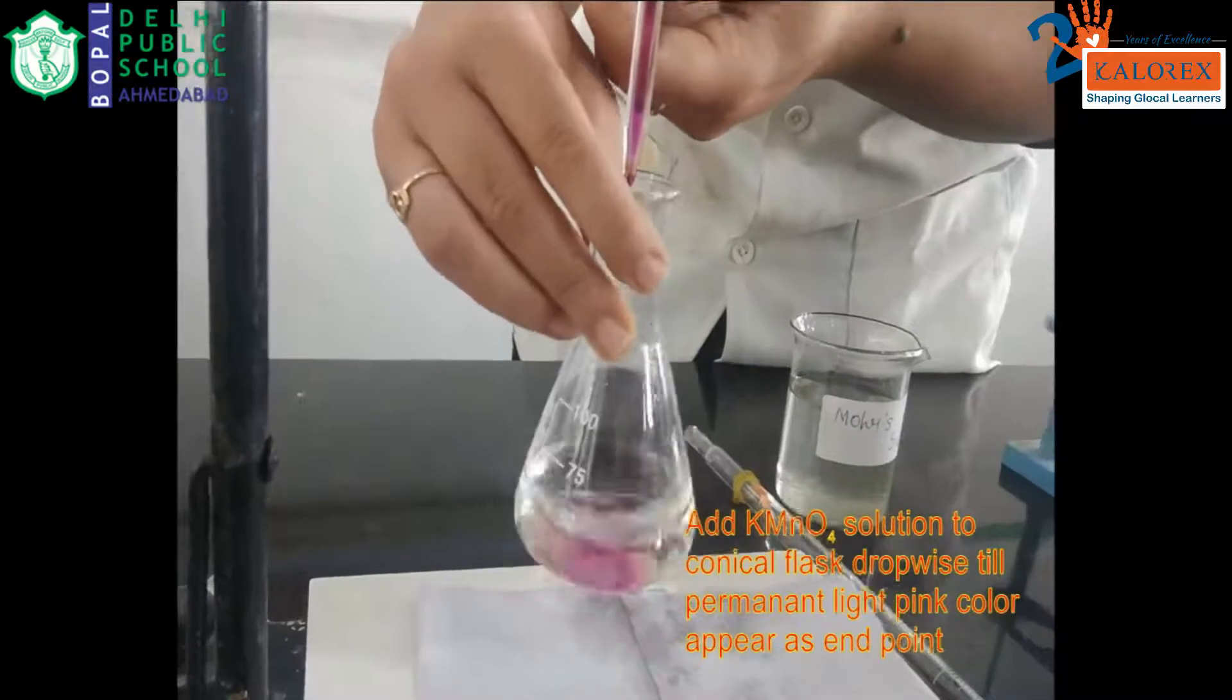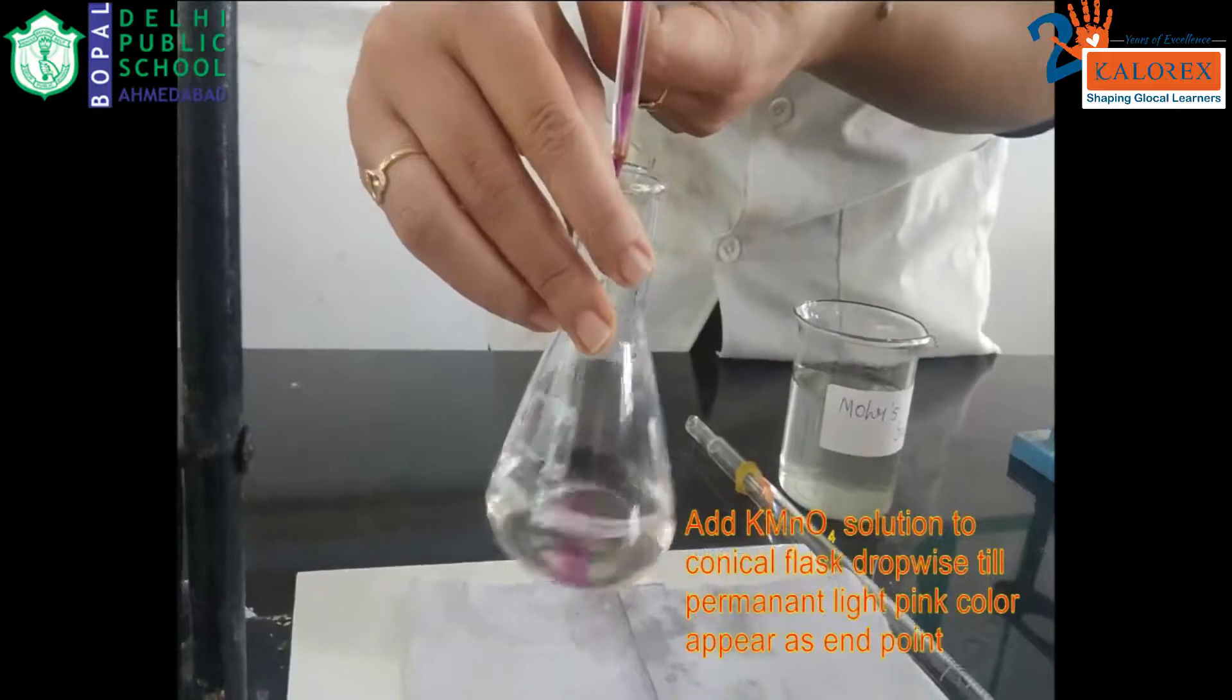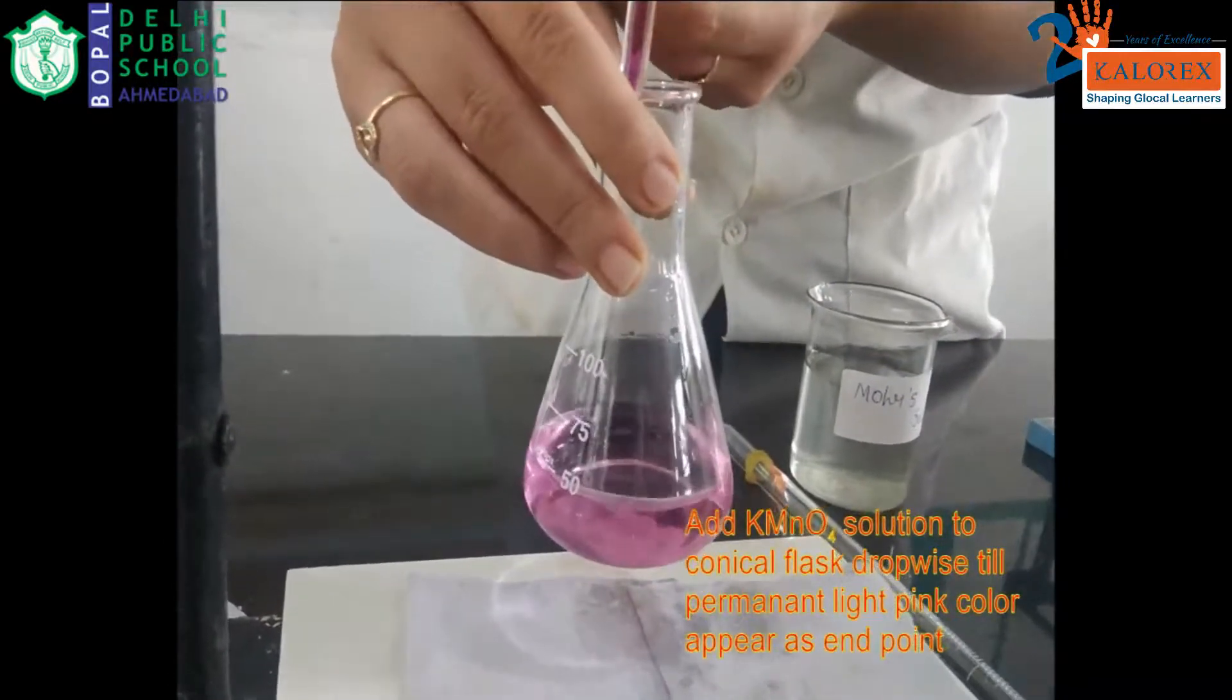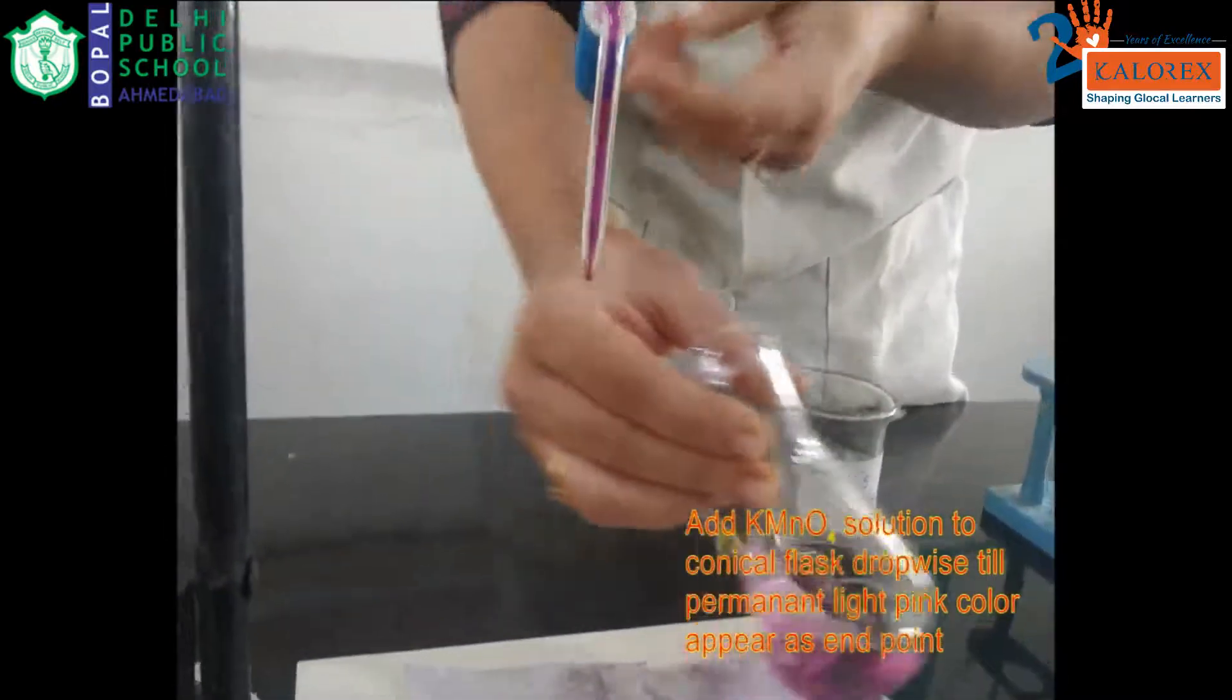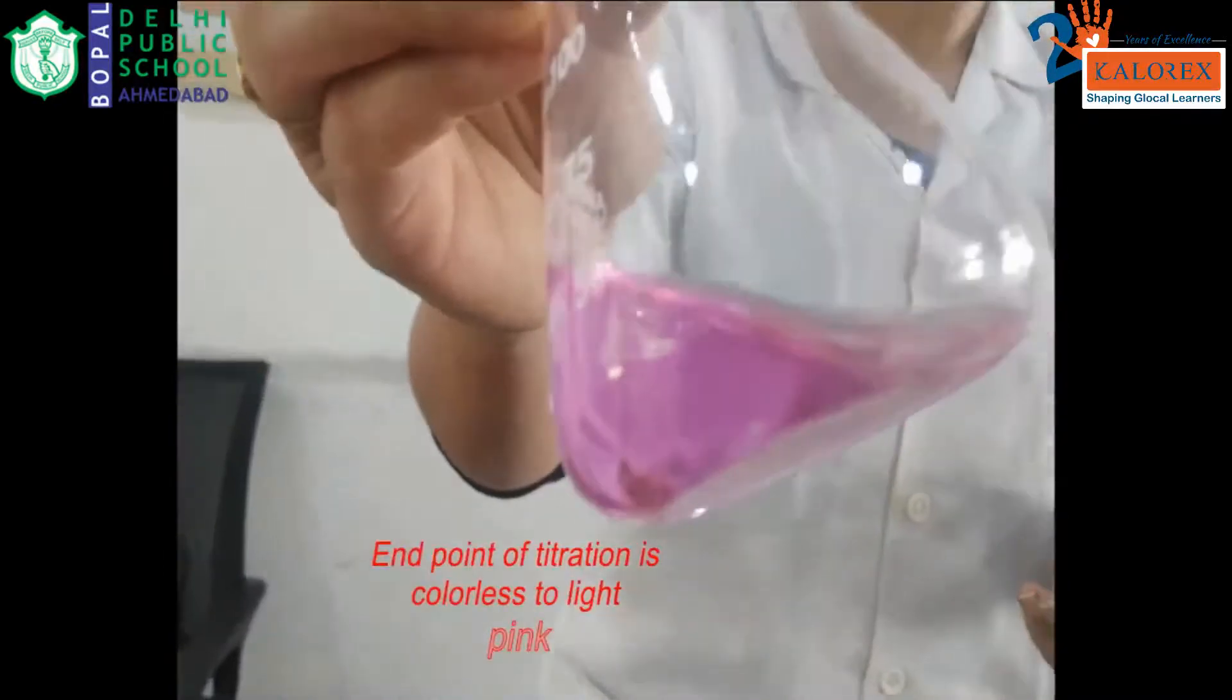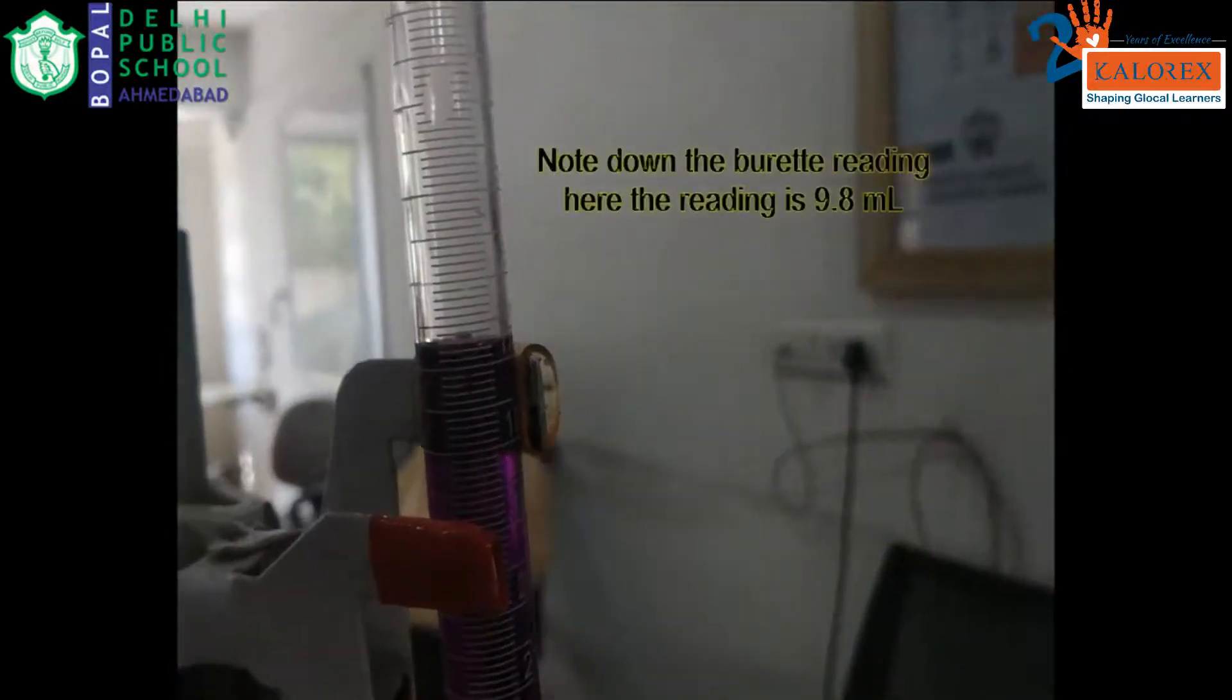While adding KMnO4, if you find the pink color comes into the entire bulk, that means the titration endpoint is very near. Just add one extra drop to ensure the permanent pink color of the solution.